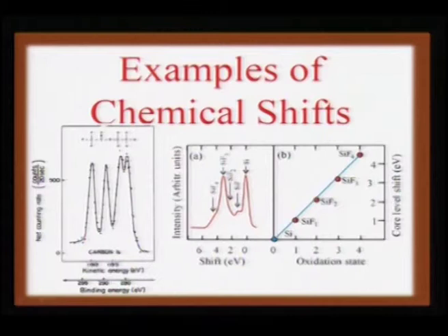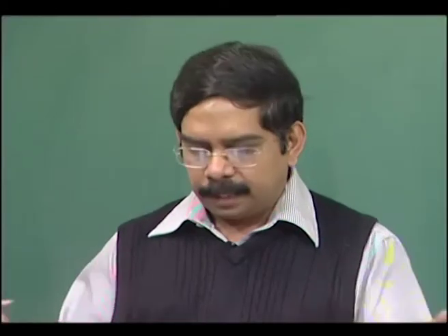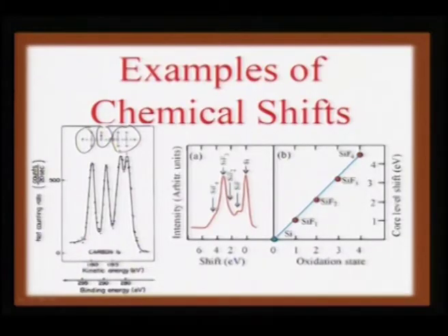This is a compound with fluorine as substituted groups, and then you have carbon-hydrogen bonds and carbon-oxygen bonds. So, clearly we have 3 different ranges of substitutions in this polymer, and if you take an XPS spectrum, you can clearly find out that the carbon 1s spectrum will have 3 peaks, and all these 3 peaks correspond to different bonding.